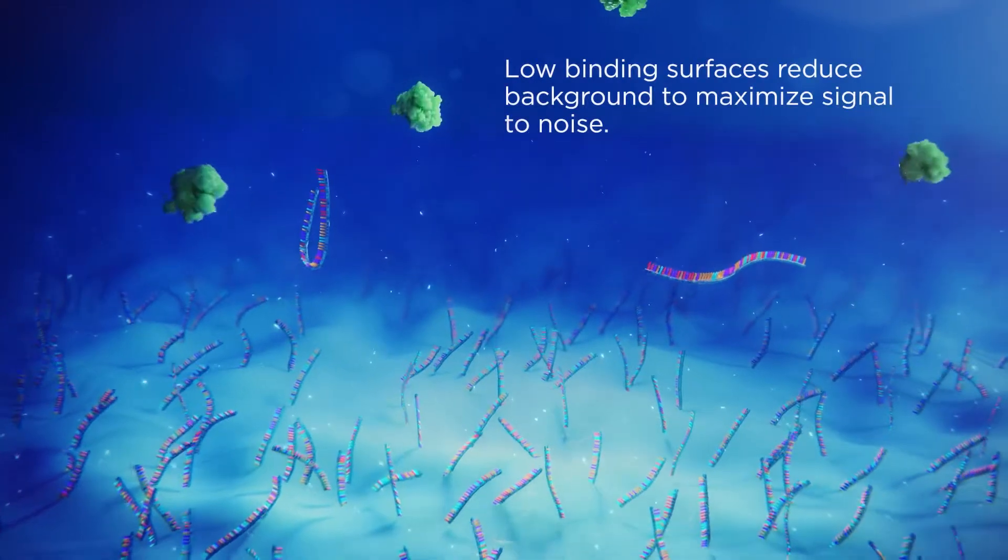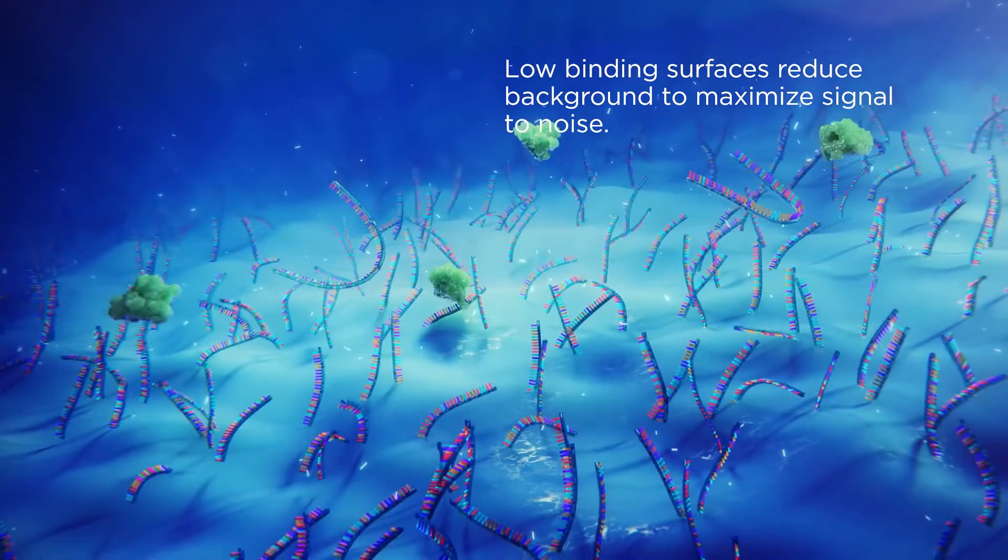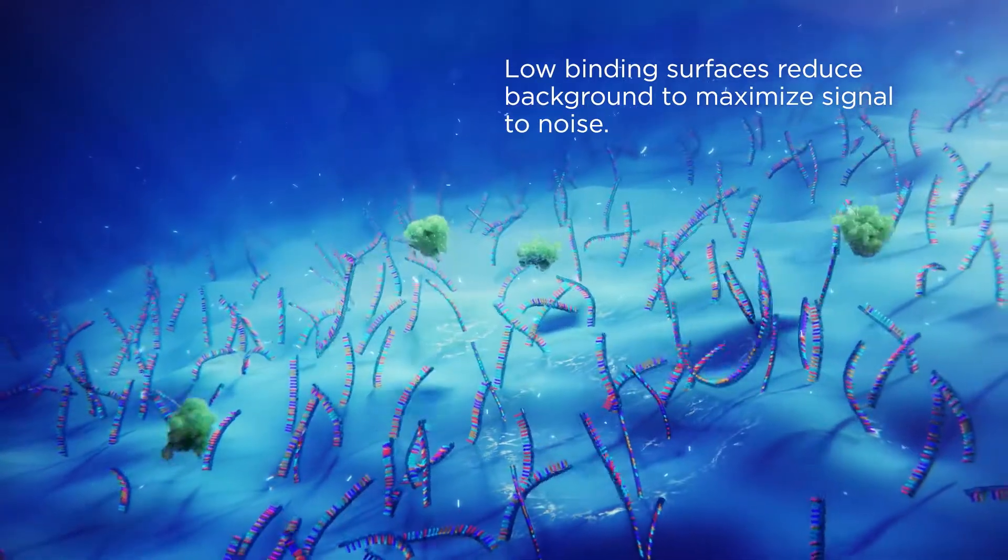Low binding surfaces reduce background to maximize contrast to noise for the highest quality DNA sequencing data.